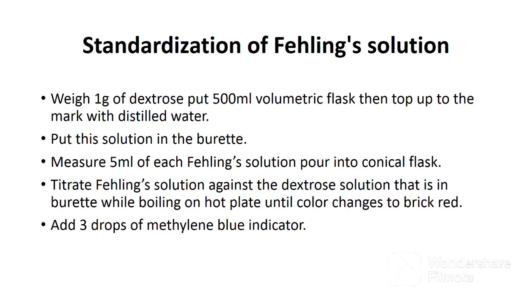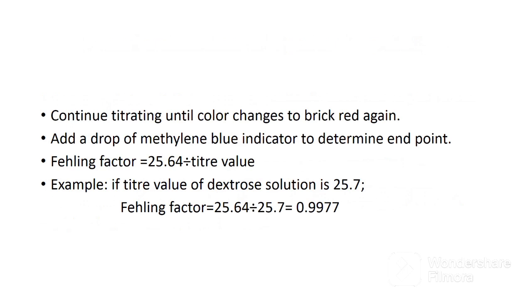Weigh one gram of dextrose powder and put it in a 500 ml volumetric flask. Add some water and shake to dissolve all the dextrose powder. After dissolving, top up with distilled water to the mark. Put this dextrose solution in the burette and mount the burette on the stand. Measure 5 ml of each Fehling solution and pour into a conical flask. Titrate the Fehling solution against the dextrose solution in the burette while boiling on a hot plate until the color changes to brick red. Add three drops of methylene blue indicator.